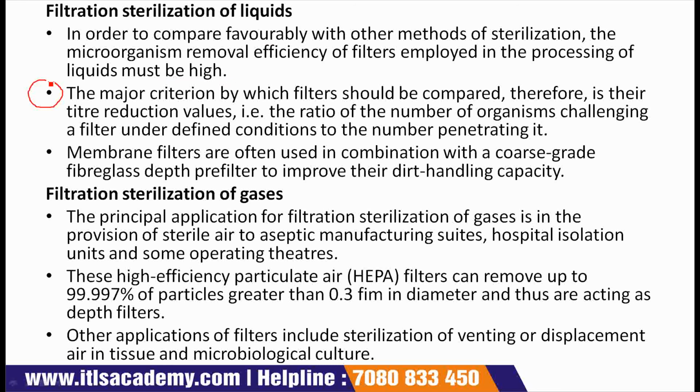Next point, the major criteria by which filters should be compared, therefore, is their titer reduction values, that is, the ratio of the number of organisms challenging a filter under defined conditions to the number penetrating it.